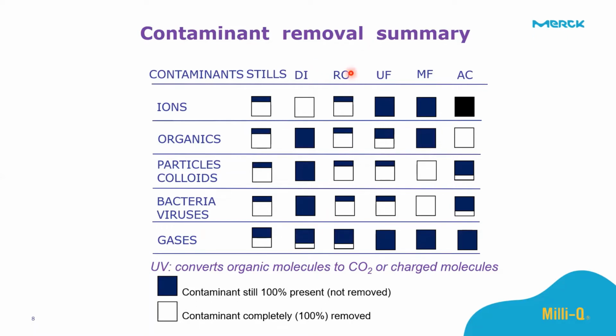Of course, we have reverse osmosis that normally touches all the contaminants, but does not really remove all the contaminants completely. And the same for UF or ultrafiltration, microfiltration, and activated carbon. So what is really common here is that reverse osmosis and distillation have something in common. They're called the universal purification techniques because they normally touch on all the contaminants.